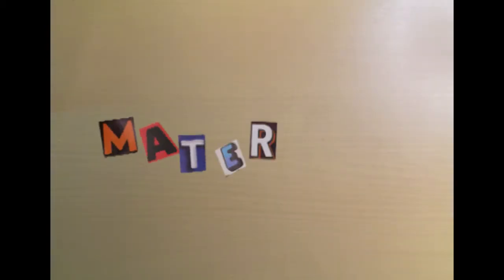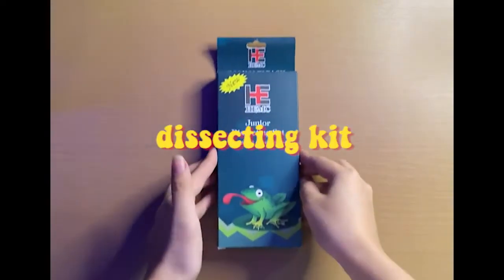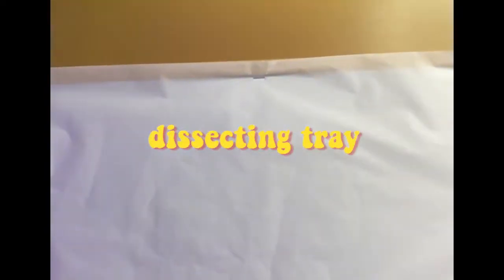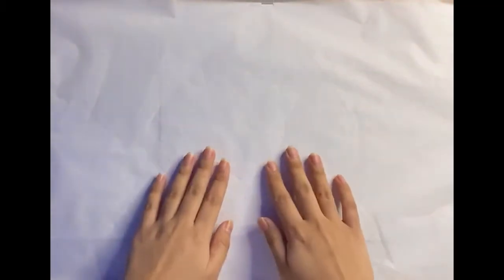Now, let's identify the materials to be used in our experiment. First, we have our dissecting kit. Second, we need a dissecting tray to hold our specimen. I used a cork board and covered it with baking paper to avoid any spillage seeping into the board.